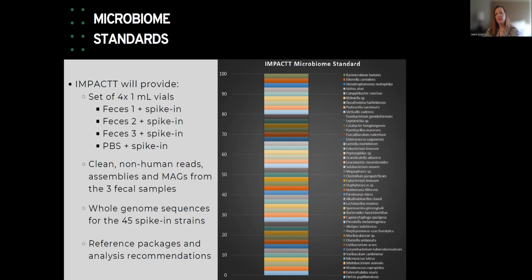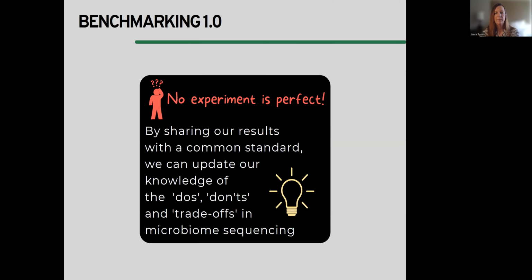We're also producing the whole genome sequences, and we'll share those draft genome assemblies with the community. And lastly, we'll produce reference packages, like a 16S reference package, and we'll be running these through all of our methods this summer to provide analysis recommendations.